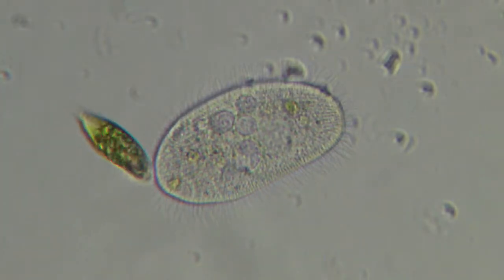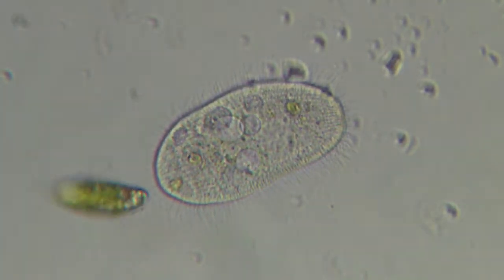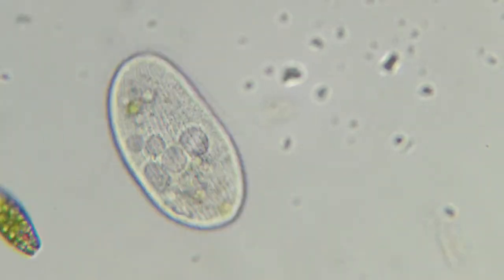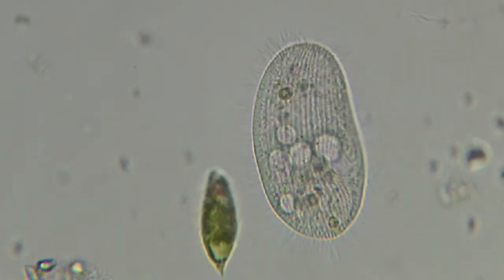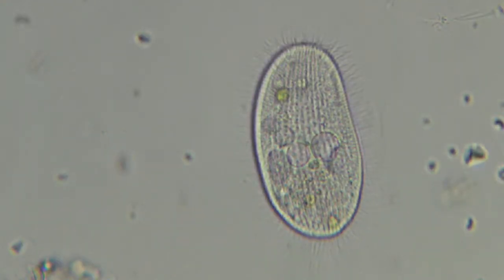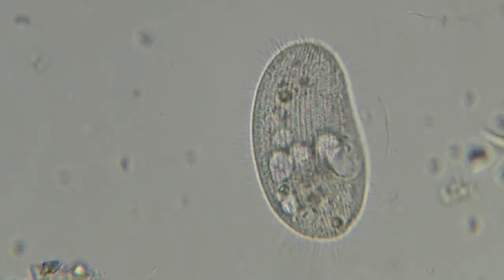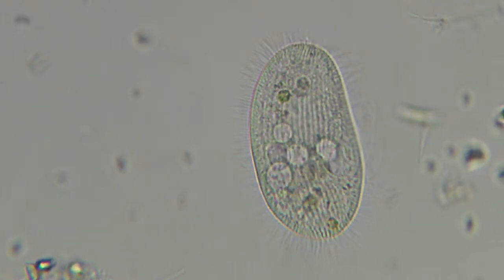Show that cilia a little bit better here. Let me change the condenser a bit. It's on the move again, maybe. We'll see. Yeah, I like the fact that you can see the food inside still moving. You don't see that very often. It's inside that one food vacuole. Too funny. Sometimes defocusing, you can see the contents a little bit better, as the vacuoles move around inside the cell there.